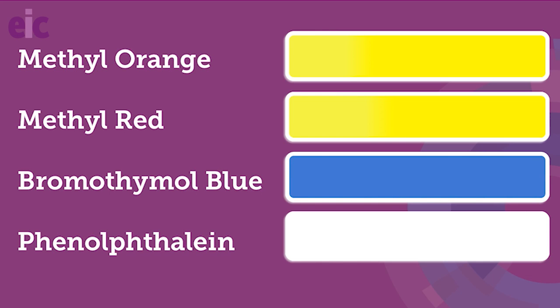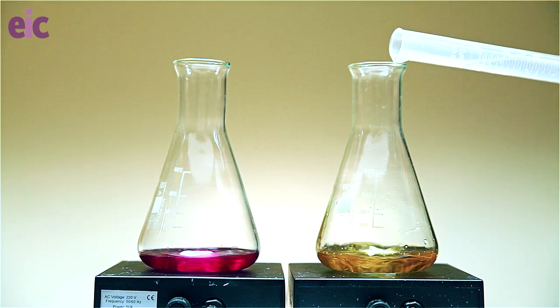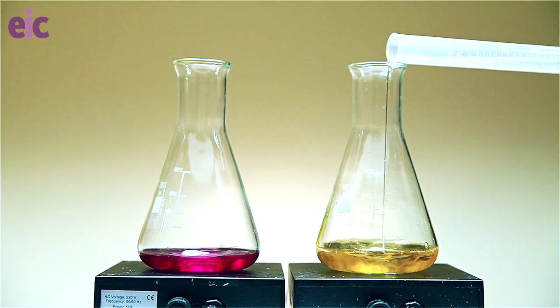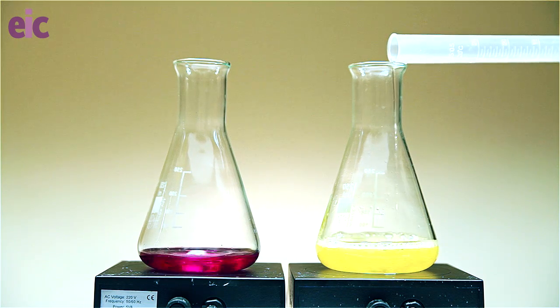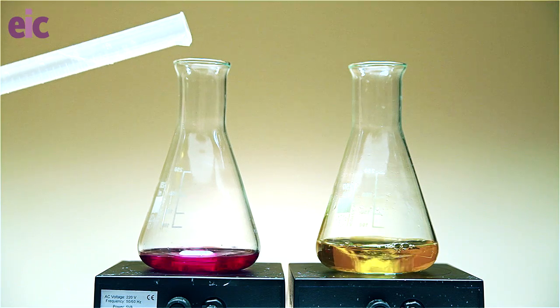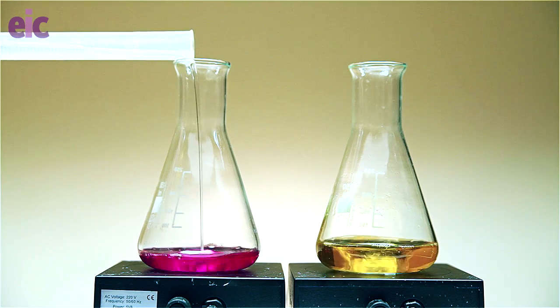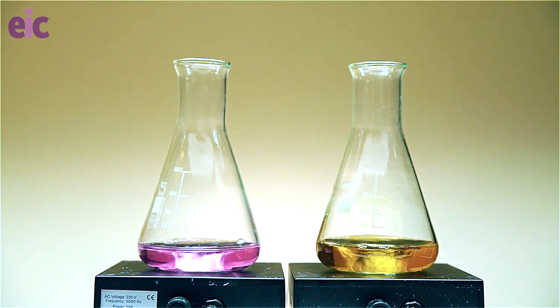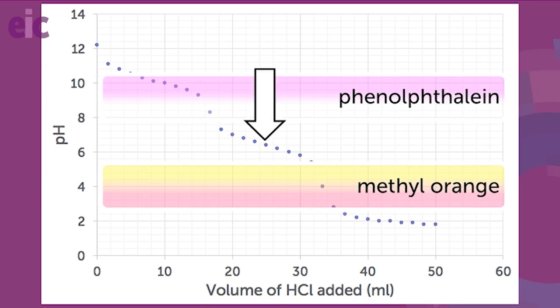Let's repeat the experiment with hydrochloric acid, which you're far more likely to use in the titration against a carbonate solution. We're going to see how phenolphthalein and methyl orange perform as indicators. We'll add just under half the amount of acid needed to completely react with the carbonate. At this point, phenolphthalein has completely turned colourless, but methyl orange has a long way to go.